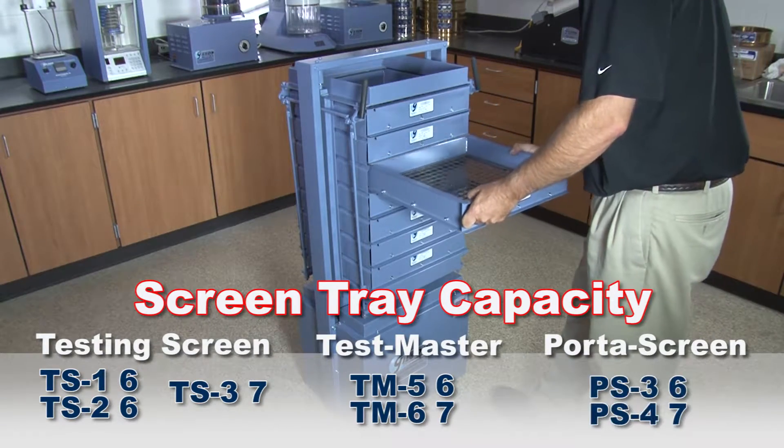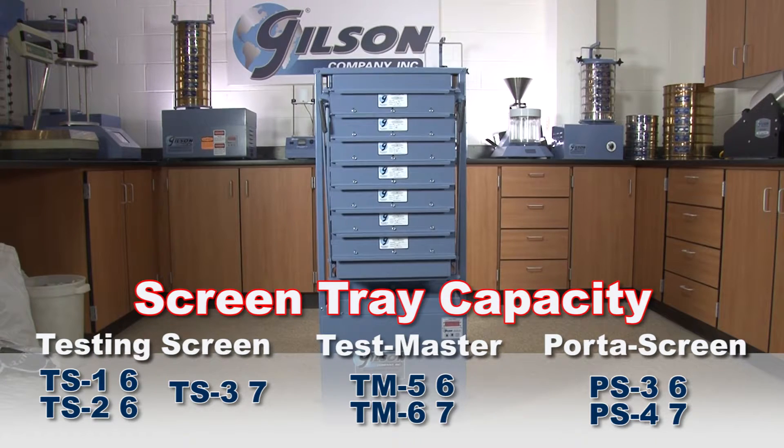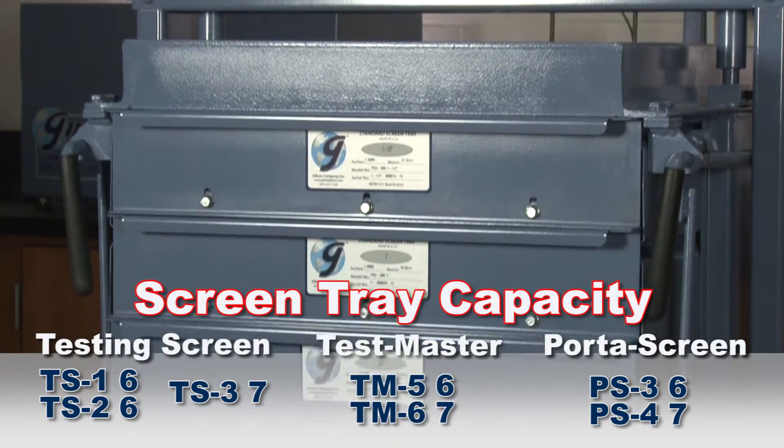The Gilson PS3 Porta screen has a six screen tray capacity, while the PS4 Porta screen holds seven screen trays plus a pan.